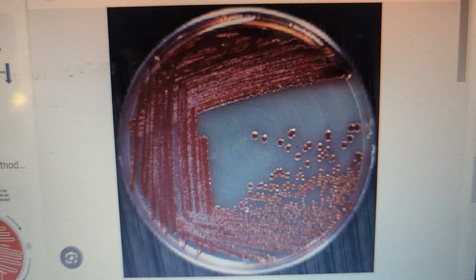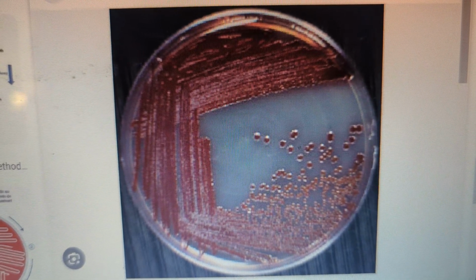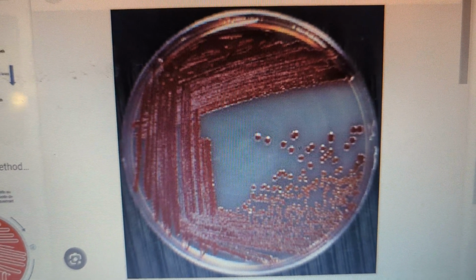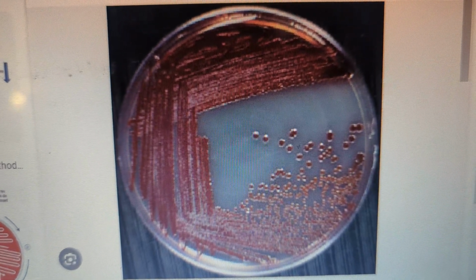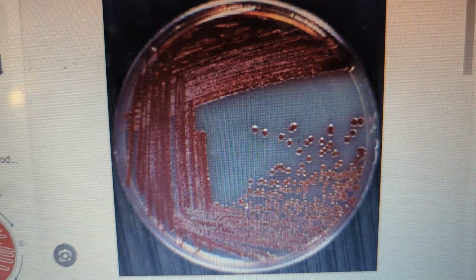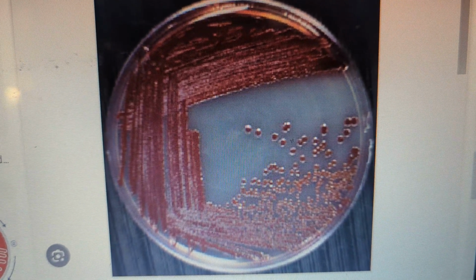Okay. So that is the idea, and all of these characteristics that you're able to gather then inform you that perhaps the identity of the bacterium is such and such. Okay. You look at literature, of course, and all that is known, to piece the clues together based on what you have studied.